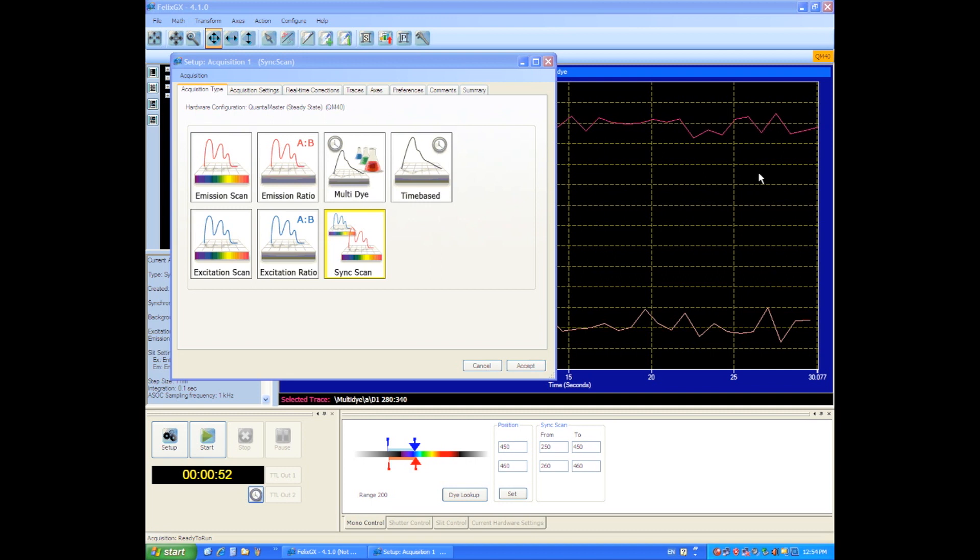It's useful for identifying unknown samples. Let's say you didn't really know the properties of a fluorescent sample.